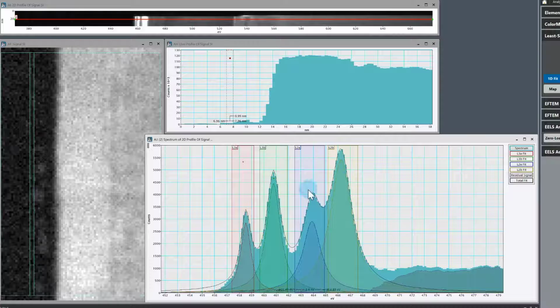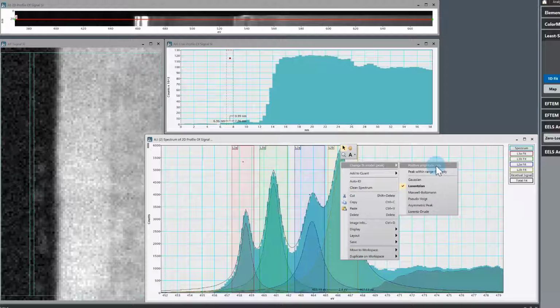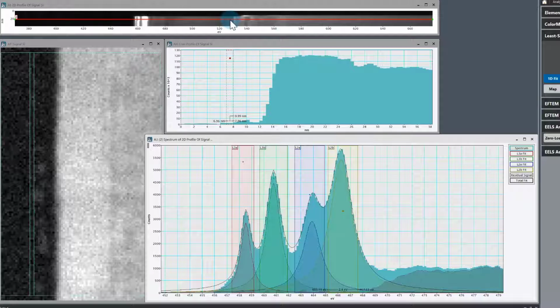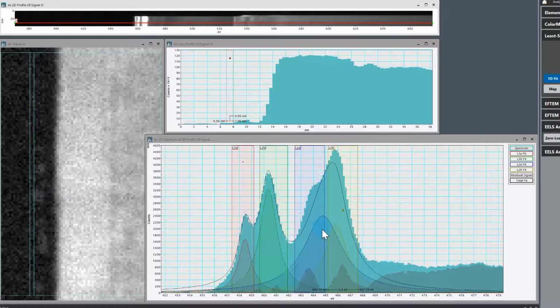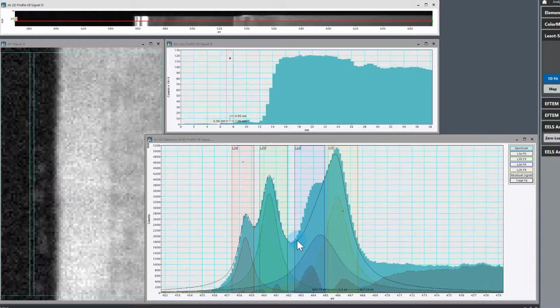So we want positive amplitude, peak within ROI range. So first of all, peak amplitude, peak, yeah. So see if that makes any difference. I don't suspect it will for the L2. So the L2, again, that maximum still is a little off for this L2A. But the rest is pretty reasonable.